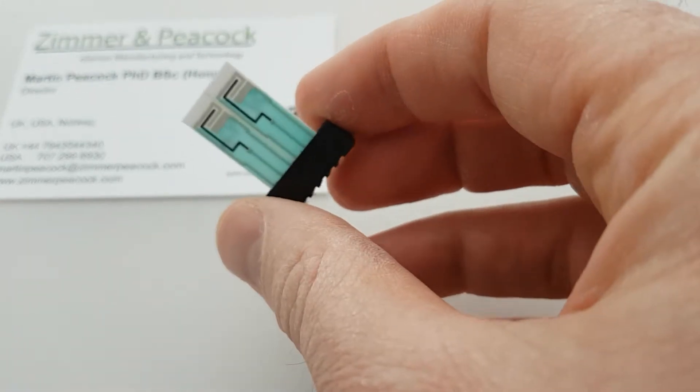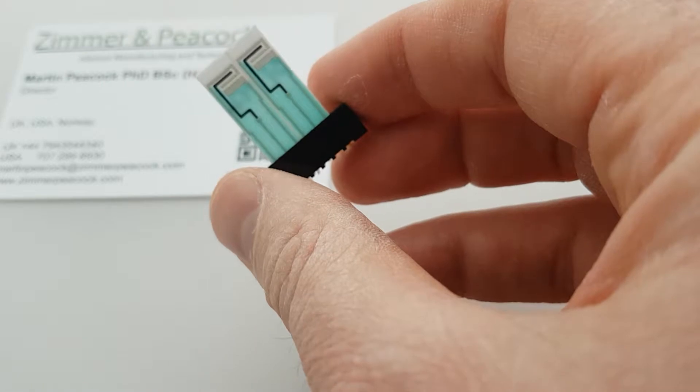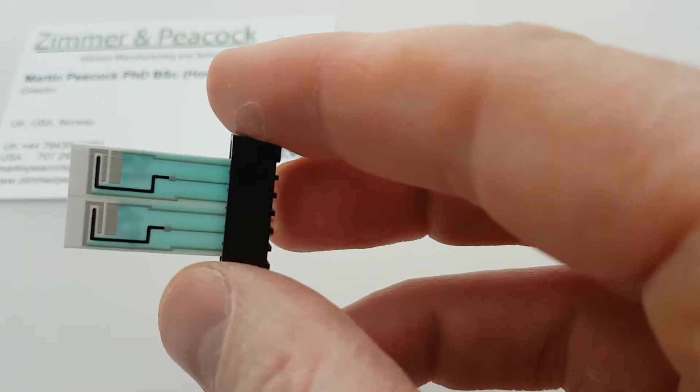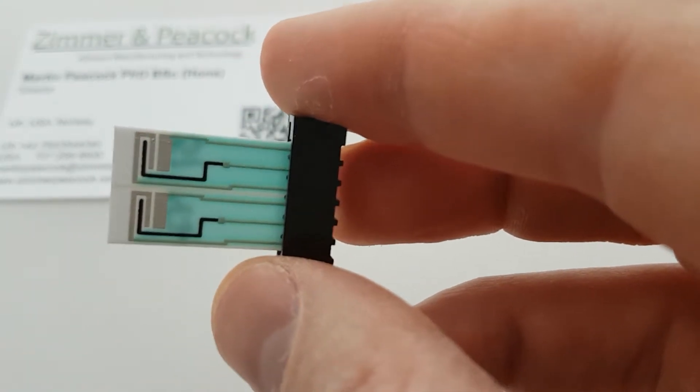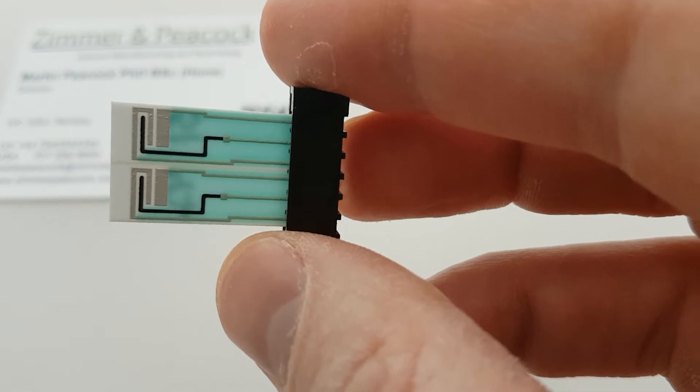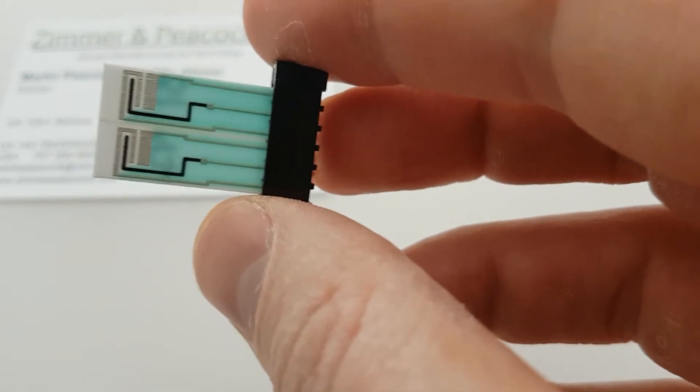The way we often make these kind of electrodes is they're made in a wafer, and we laser scribe. If I bring it close, you can just about see that there's a laser scribe down the middle of these two sensors. And we snap them apart, and then that's how we singulate.